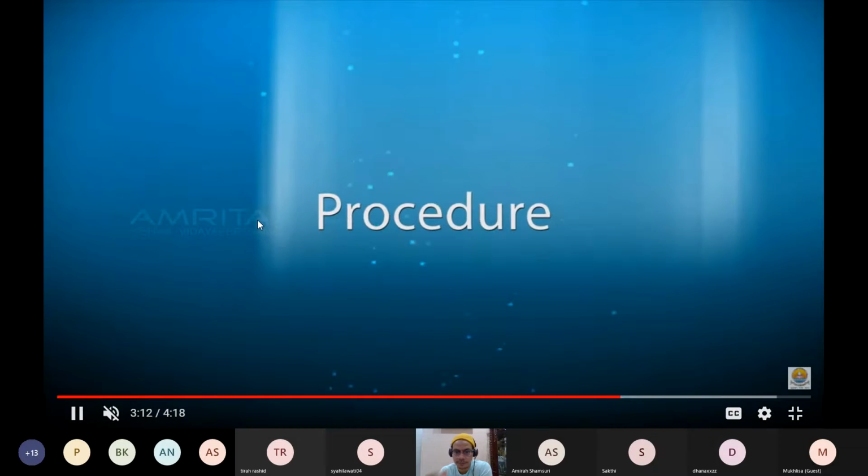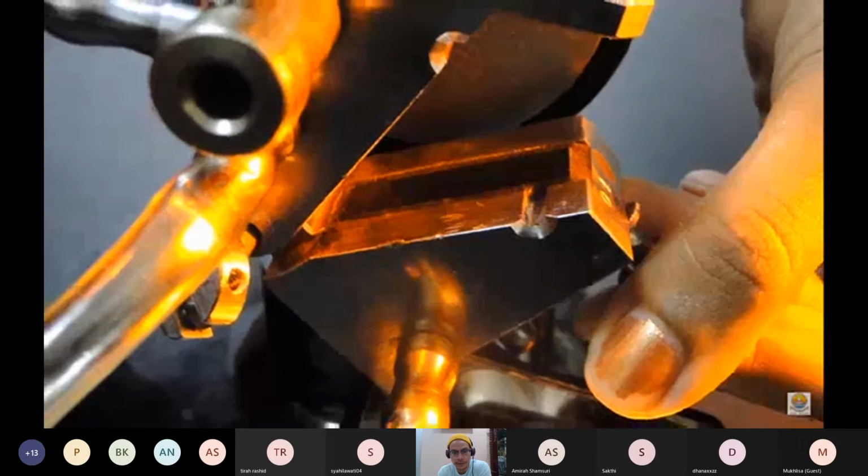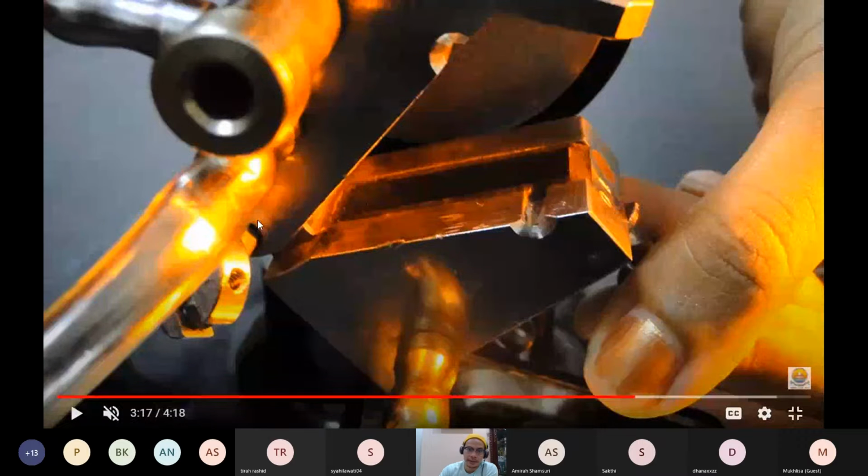Okay, so the procedure. So this is what the refractometer looks like. This is the place where we, dekat bawah ni ada satu macam crystal, quartz, batu quartz, and the clear. Dekat bawah ni dia ada satu sumber cahaya. So this is where we place our liquid sample. So kalau macam ada ubat salbutamol respirator, ubat sesemar.